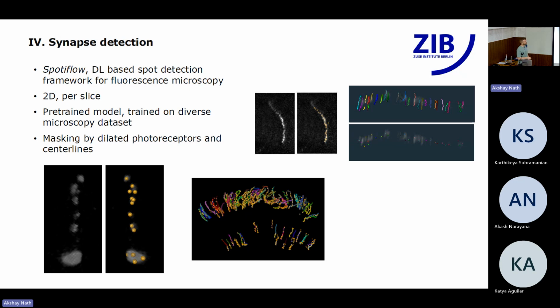So just to clarify, the right images are for slices, whereas the bottom. Sorry. Yeah. Both are actually volume rendering, but here you can see just slices stacked on top of each other. And for the bottom one, we take, let's say, the average center of mass for each. How does that compare with the lower right image? This one? Yeah. So for example, here you can see these dots, each voxel would be one of those spheres rendering a synapse.